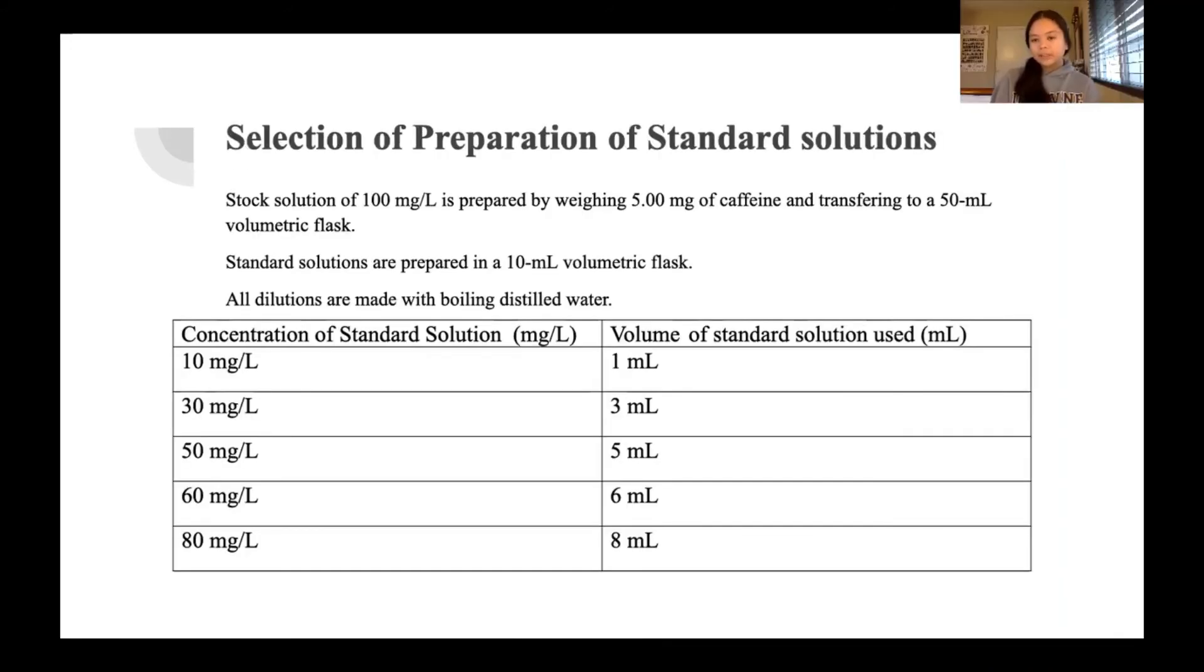To prepare the standard solutions we chose reference 5. The stock solution will be prepared by dissolving 5 milligrams of pure caffeine in a 50 milliliter volumetric flask and this will be diluted to the mark with boiling distilled water. The stock solution will have a concentration of 100 milligrams per liter.